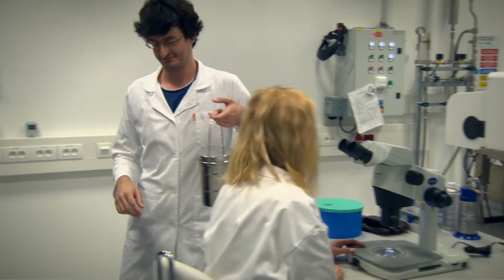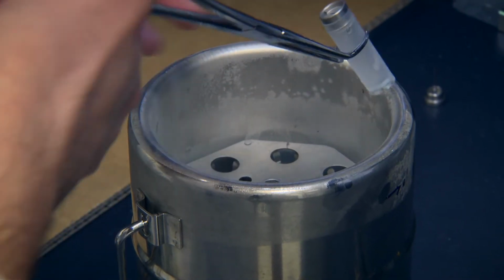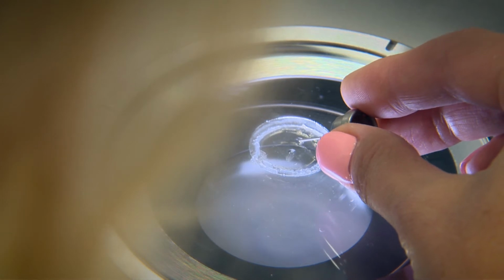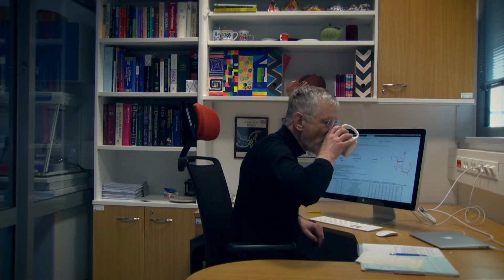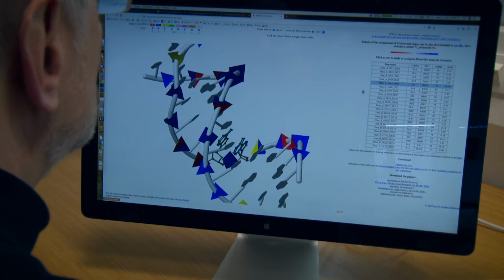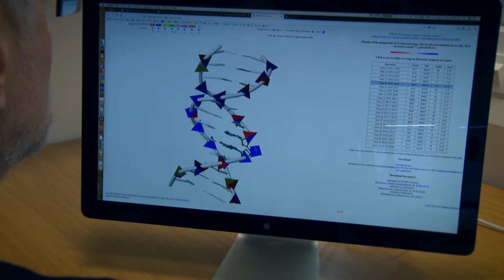Therefore, in addition to the structural characterization of interleukins and interferons, we strive to modify their properties. We search for protein variants that could be used in medical treatment or diagnosis. Bioinformatics is also a significant part of the research of proteins and nucleic acids. It analyzes large collections of data and examines their biological importance.